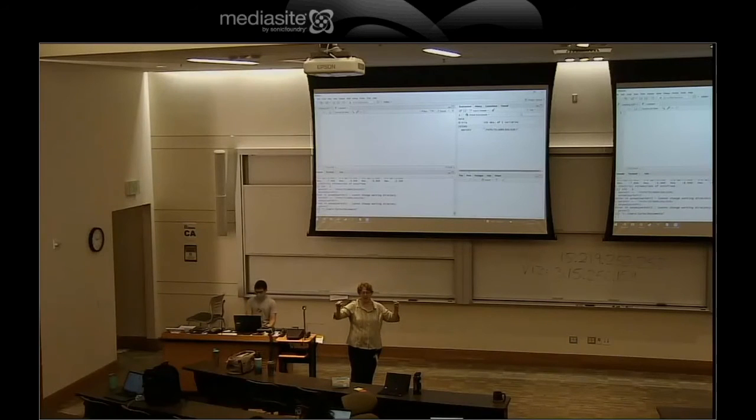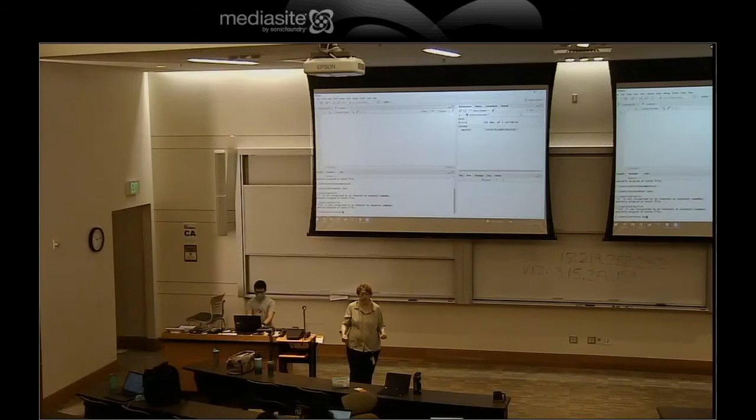Instead, we're going to make a box to put all your stuff in, so your lab mates don't have to dig through it. What's the box? It's a folder on your computer somewhere. So working directory is a folder on your computer. Let's set the working directory in the script for now.